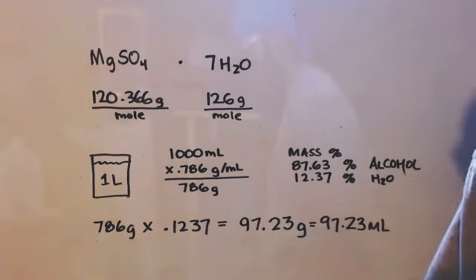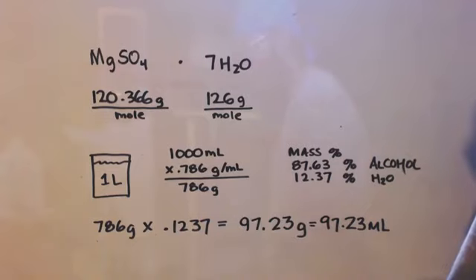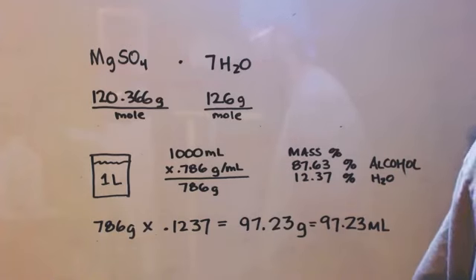With a fractionating column, you still have to do it probably twice to get it to 91. Getting it up to close to 91 is easy. Getting it to actual 91 is almost impossible. So keep that in mind. If you do recycle your solvents, don't just distill it once and think you got 91%. You ain't got no 91%.